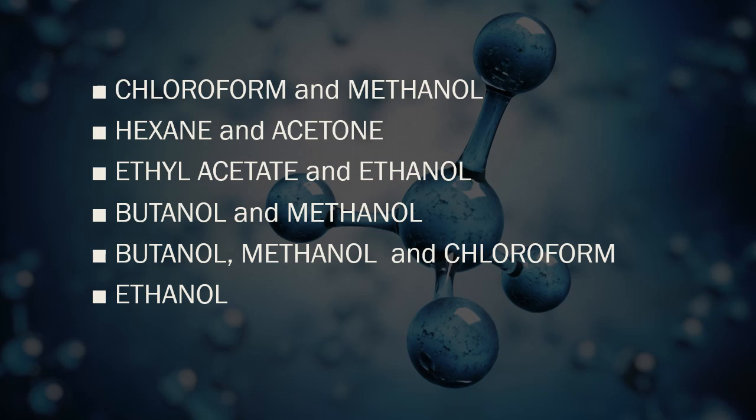Your chloroform and methanol is the commonly used solvent to extract lipids from human tissue, at a 2:1 ratio, two parts of chloroform and one part of methanol.